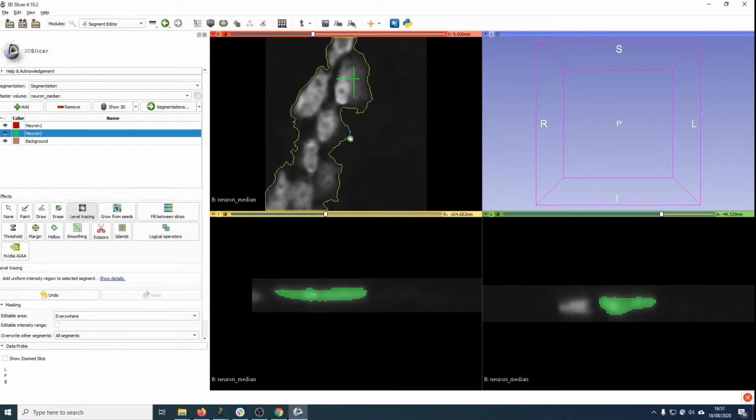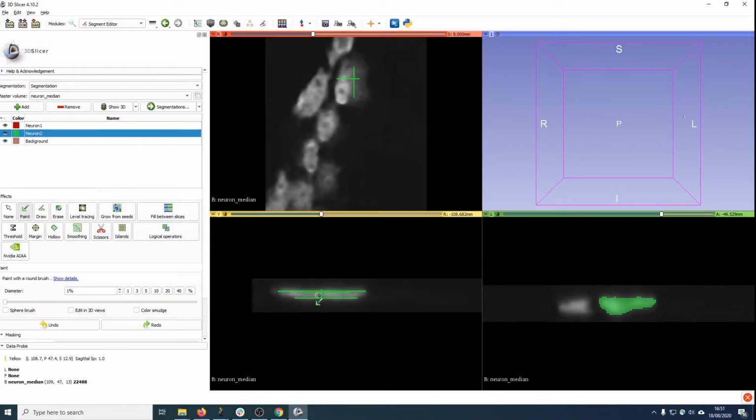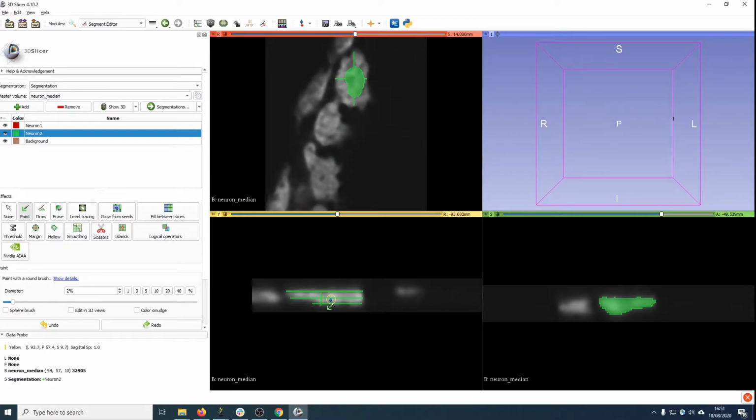So you can keep doing this. So what I'll do is I'll just hover my mouse over this and I'll scroll. If you want to see how you're going through this, when I scroll, you can see the mouse moving through the length of the object. So yeah, you can see this when I'm scrolling through this slice. That's a good way. Sometimes I forget which view it is, and then I scroll through this to actually figure out where I am in that particular cell. If I go here, you can see this. So this is quite handy.